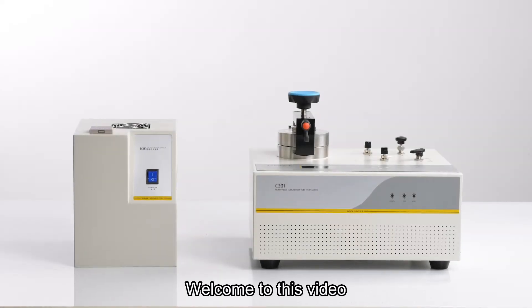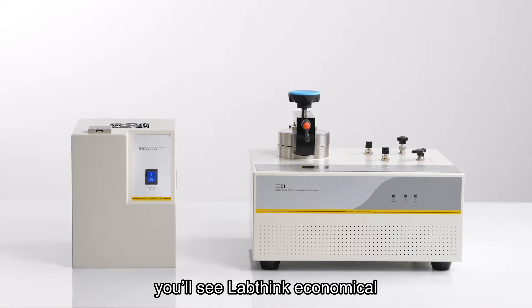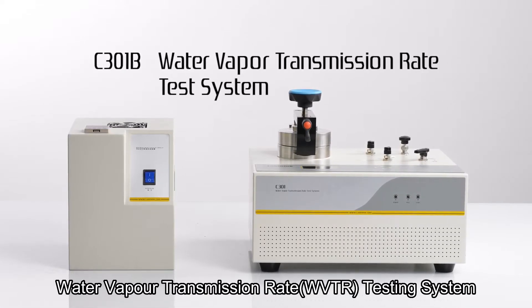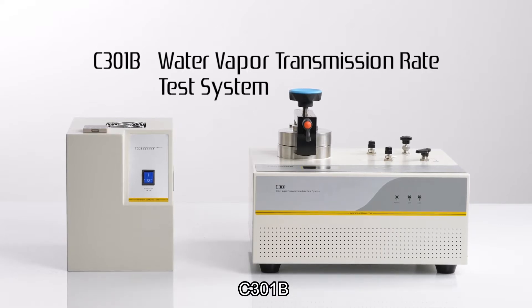Welcome to this video. In today's video, you'll see LabThink Economical Water Vapor Transmission Rate, or WVTR testing system, C301B.